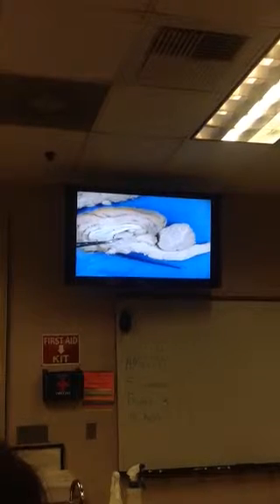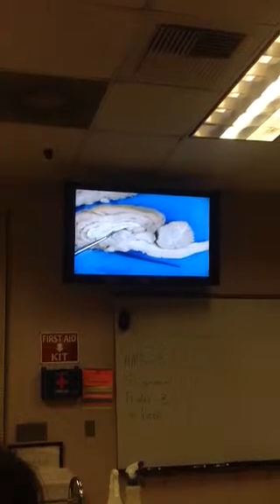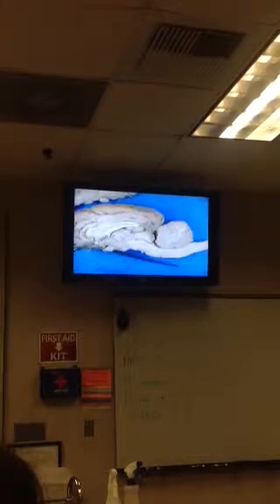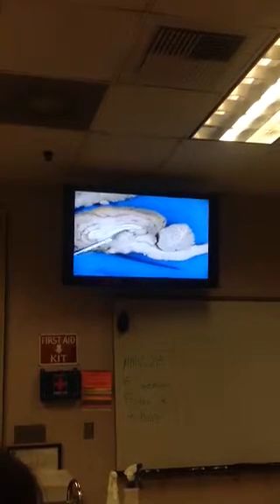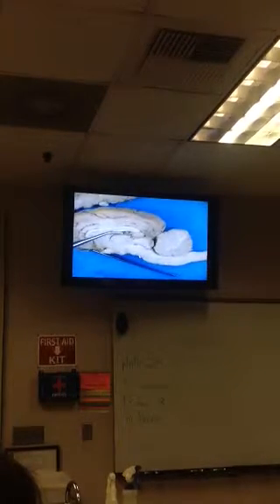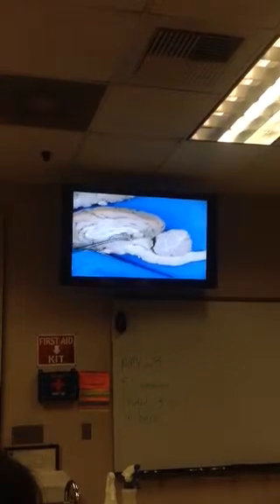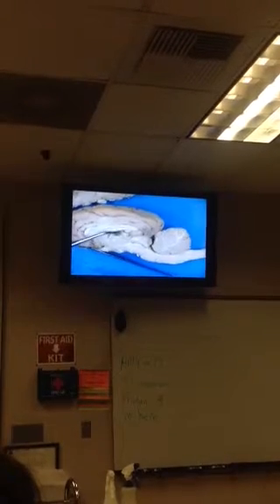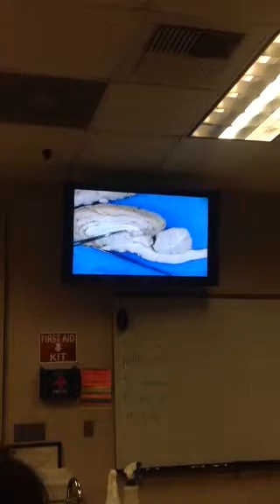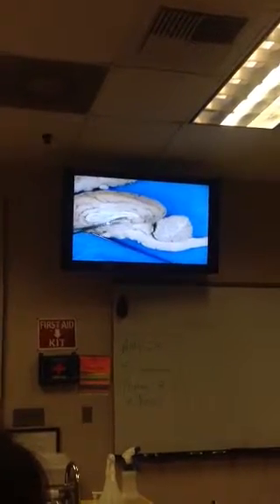Okay, around the thalamus, see the space right here? Kind of the best way to look at it, between the fornix and the thalamus, this space is the third ventricle. Now also, within these ventricles, you'll be looking inside there and there'll be this black or brown stuff in there. See that stuff I'm peeling out? Right there? That's the choroid plexus. Okay, don't rip it completely out, just push it back in. There. So the space is the third ventricle. That stuff in there is the choroid plexus, which helps to produce the CSF in all of these ventricles.